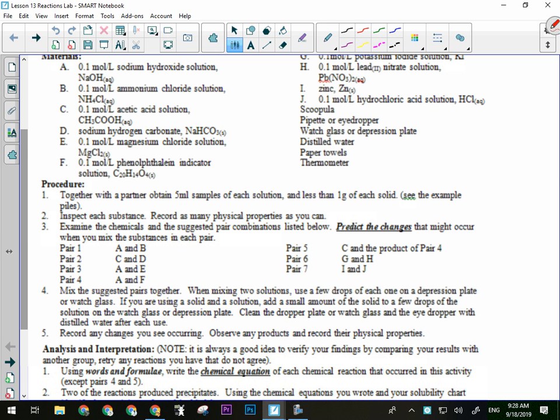So in your explanation, you need to tell me how is that happening? Why is that happening? One or the other, okay? But you need to kind of explain that in your explanation. Now you need 3 controlled variables. Your controlled variables are probably all going to be environmental, because reactions can be affected by environmental conditions.